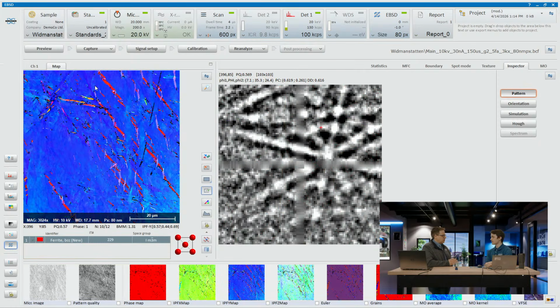And this is where it's a little bit different than conventional EBSD, because the conventional one uses a phosphor screen. That's right, yeah. And so in a conventional one, you would just see a picture of the phosphor screen. You would get a similar kind of data set, but the way that we're acquiring the data is so much more of this century. It's like going from an old school cathode ray tube to now, because previously we would have a phosphor screen.